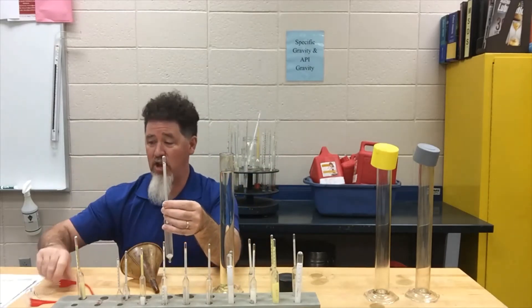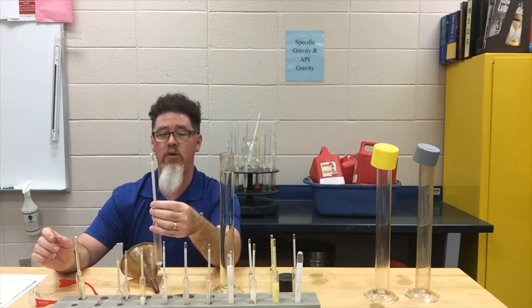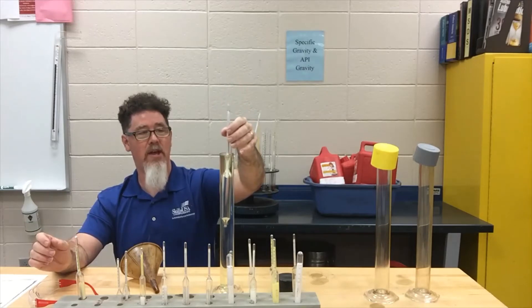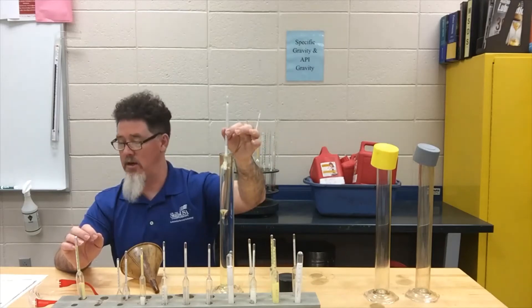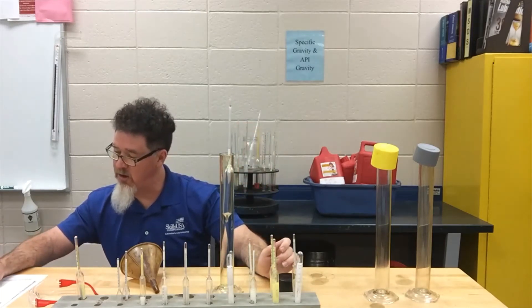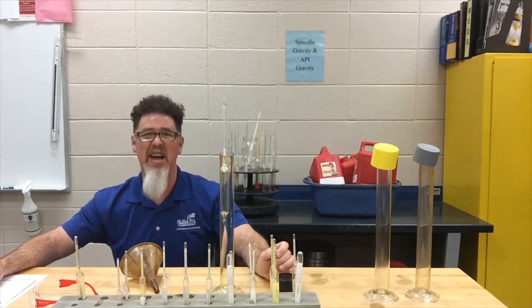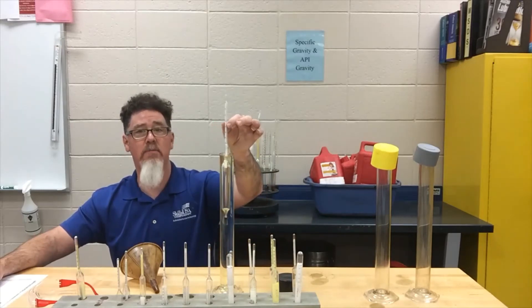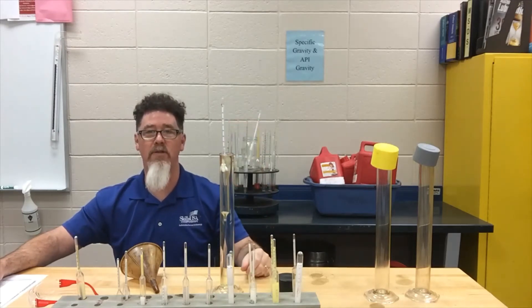We're going to select the appropriate hydrometer. This one reads 0.710 on the heavy end and 0.640 on the light end. The hydrometer did not drop down all the way — that's a problem. Looking at my chart, I know it is heavier than 0.710. Since this is straight out of the pump I'm assuming it's not extremely light, but this hydrometer is too light for this fuel — it didn't drop down far enough — so we'll have to select another one.